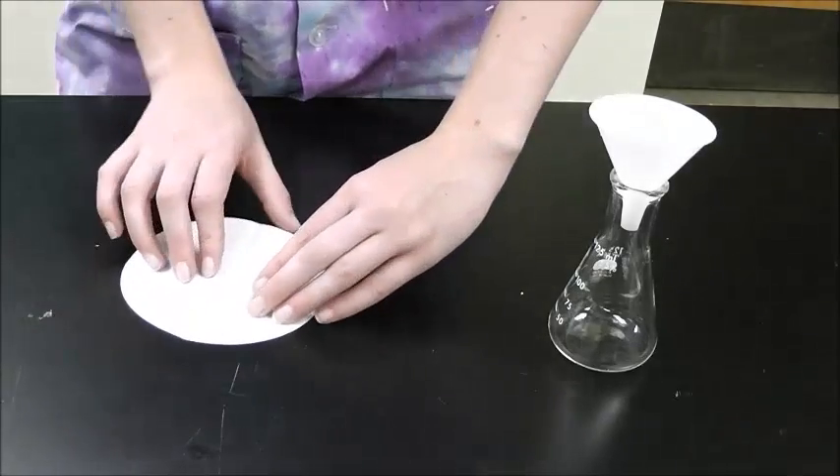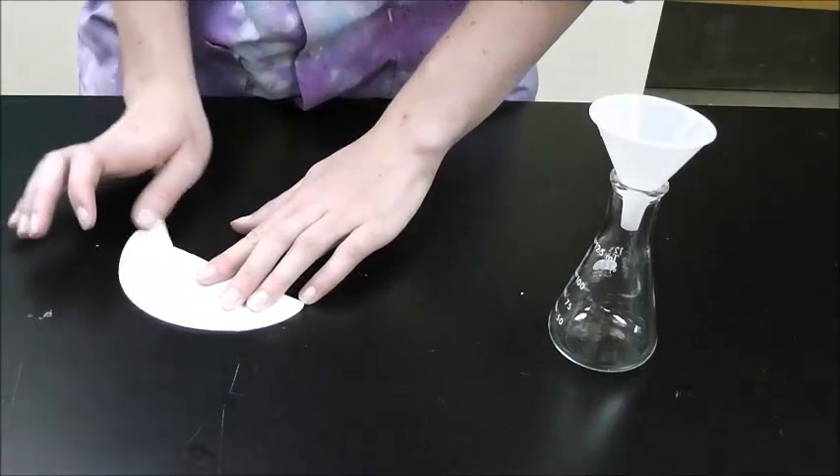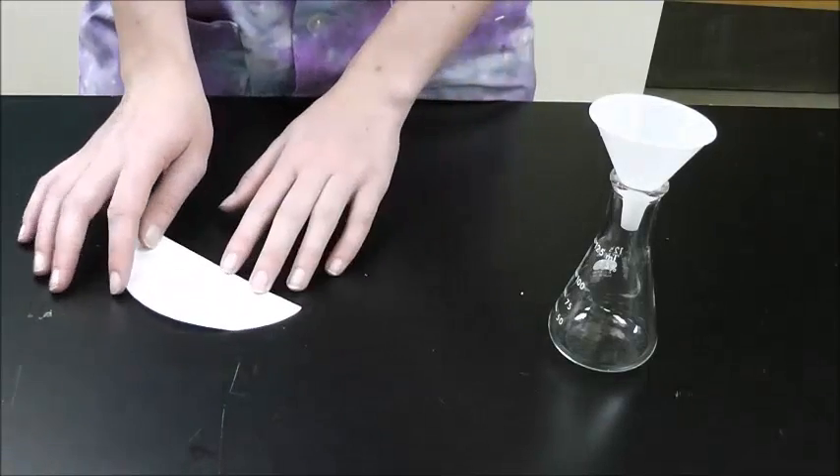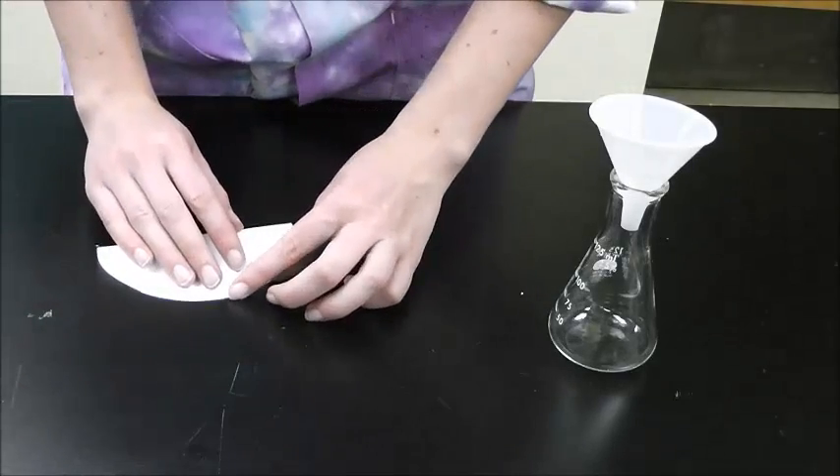Open it, rotate it 45 degrees, and fold it again, halfway between the existing folds. Open it, rotate it 90 degrees, and fold it once more.